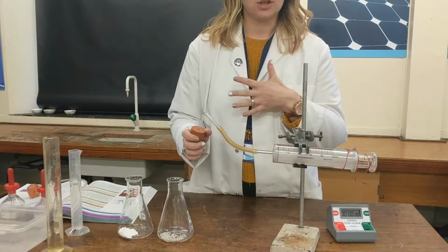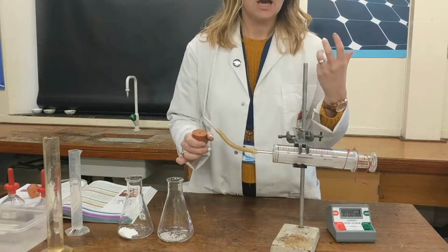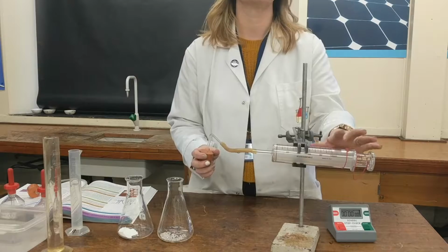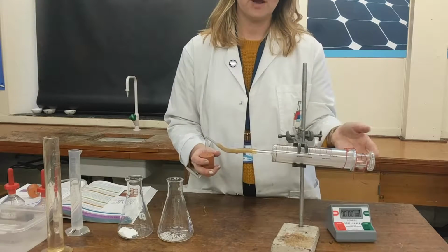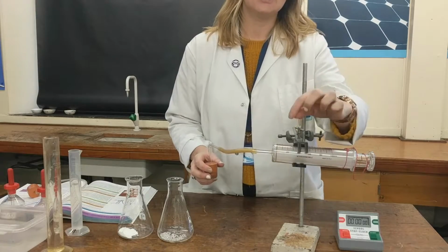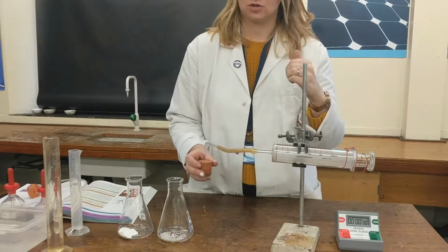Now there's two ways to do it. You could just leave it to go for a certain amount of time and see how long it takes to reach, I think this one is 100 centimetre cubed or 100 mils of gas. Or you could do it over time, so you could get your stop clock and do it every 30 seconds and look at the rate that the gas is coming off.